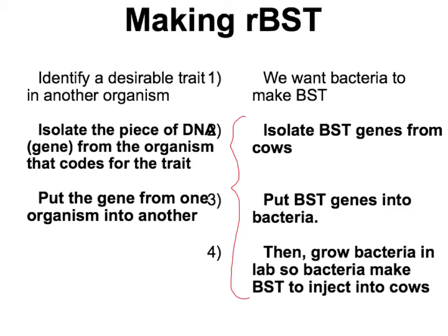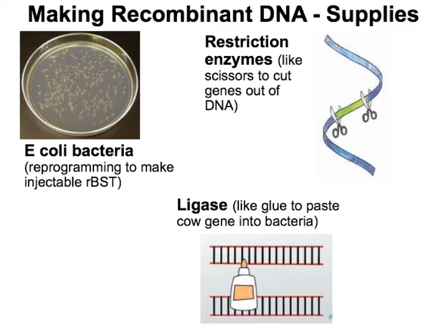Yesterday, when we isolated our own DNA, we were simulating what it would be like to do this step. Today, we're going to complete the last steps. Before we jump in, it's important to know what tools we're going to need to make our recombinant DNA, or RBST.